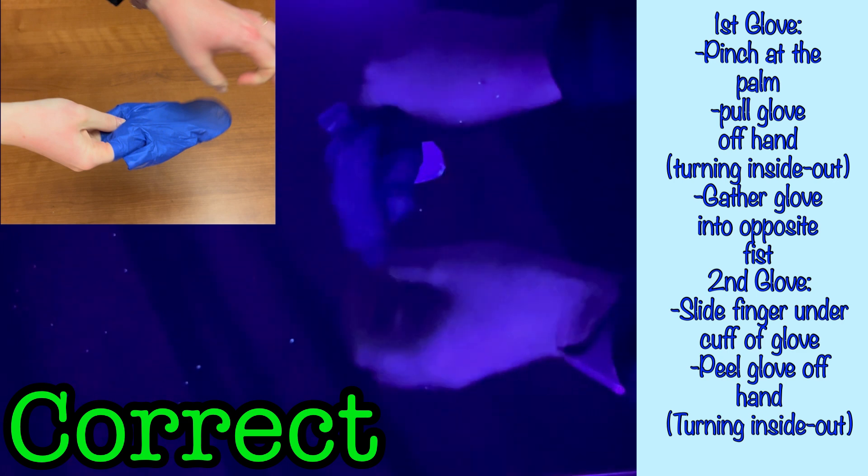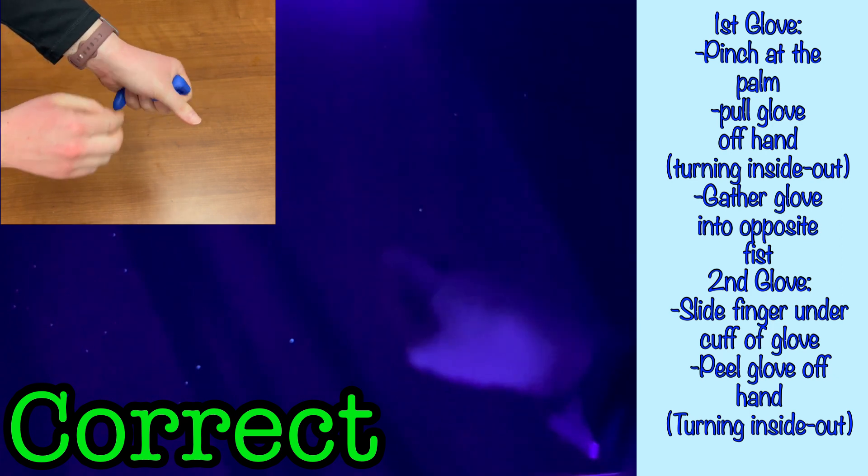By removing in this method, you have contained the first glove inside the second, and the only exposed surface of either of the gloves is the uncontaminated inner surface of the second glove. You can now handle this glove with minimal risk of contamination, and dispose of it in the garbage.